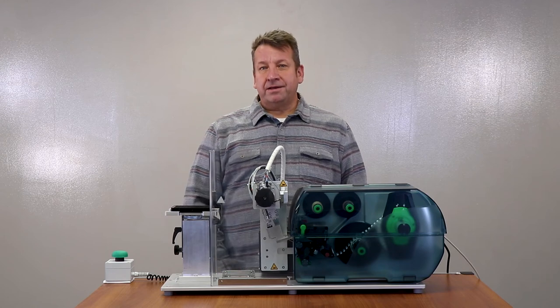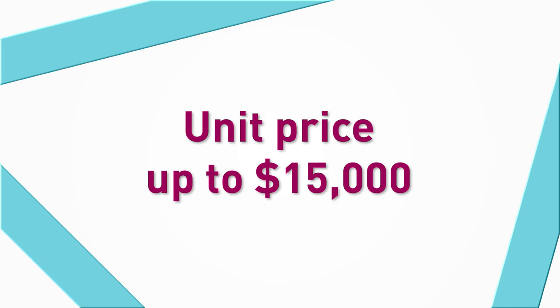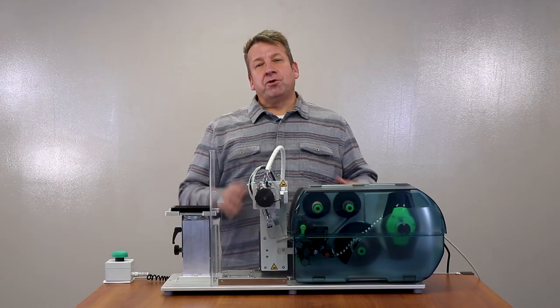Labeling well plates by hand takes a lot of time and energy, and at under $15,000 this can be the perfect affordable solution for your lab. So as John mentioned, this is a high performance solution that would be a great addition to any lab environment, and by working with us you can ensure that your applicator is ready for you as soon as you receive it.